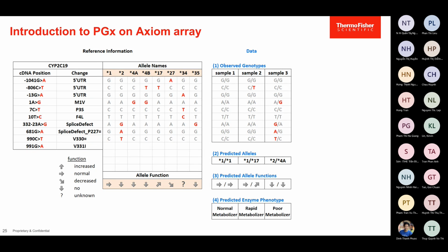So this is where this comes from. We do genotyping with the instrument. The software does the genotyping analysis, gives you each of the nucleotides, what is the answer. From here, find the pattern, match it, star allele, and then they will predict what is the allele function. This is from the database. This is also from the database. And then this one decides how you should change your medication, whether you should go for a normal dose, increased dose, reduced dose, or avoid taking the drugs. Okay.